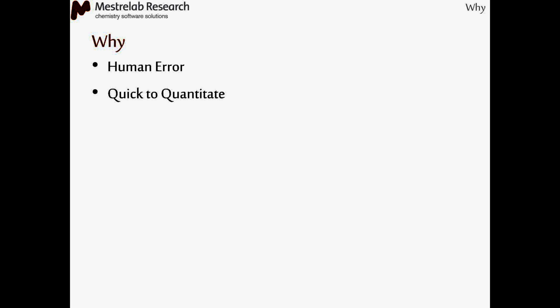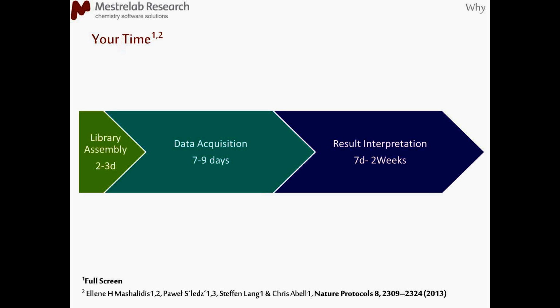Also, using automatic tools is very quick. It's very easy to quantitate your results. It's objective. Computers are not biased, and it's going to save you a lot of time. So in terms of time, there is one thing that I think most people will be in this region.